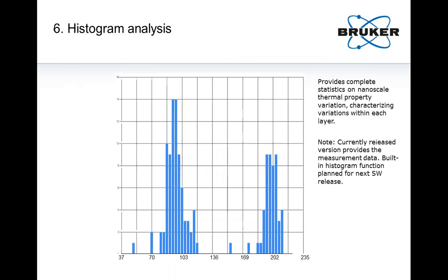And indeed, if we take this data and just plot it in a histogram, now with this large number of measurements, for one thing, we can very clearly determine centers of these two peaks, and so an average transition temperature for each of these layers. But we're also able to actually quantify a width for each of these transitions, a variation within each layer.